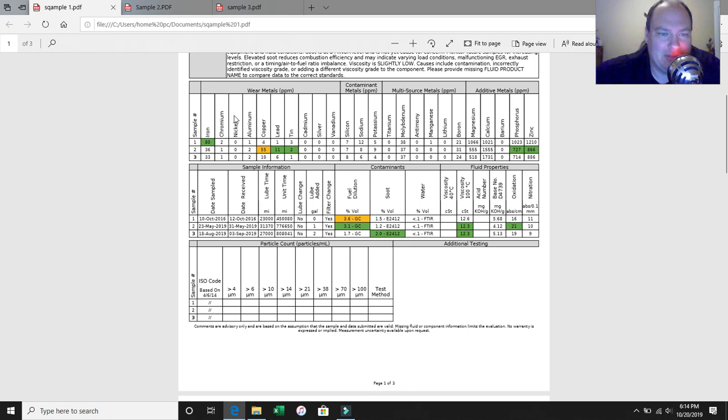It's also in some parts of your valve train. Aluminum. There is aluminum in your pistons, turbo bearings, and main bearings, as well as possibly an overlayment metal, which means it would overlay over the top of another metal, such as in a bearing. So you would start to show elevated overlayment metal wear before you would get into the iron or the lead typically.